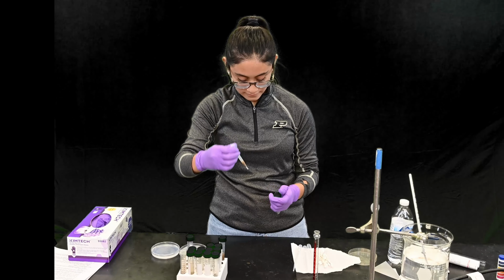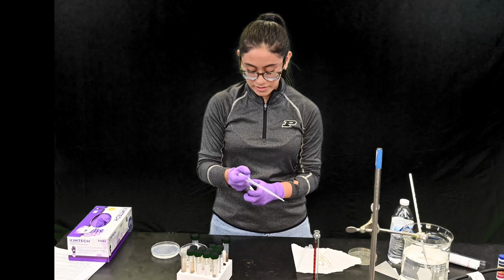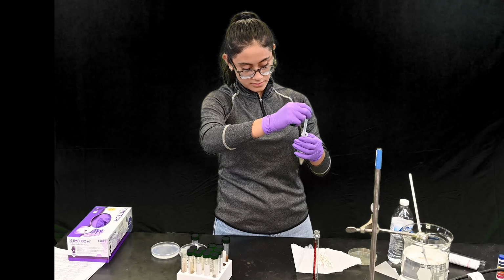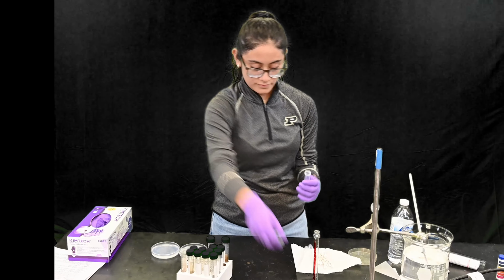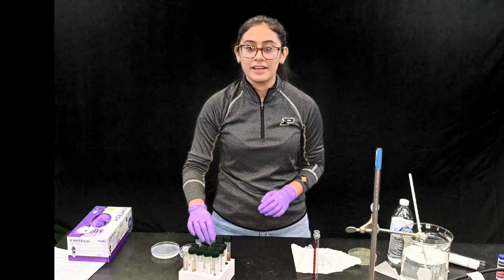This will be your dilution number 2. Now we're going to do a dilution number 3. We're going to use a new pipette and mix our dilution number 2 and transfer and obtain 1 ml. Now you have your dilution 2 and 3.